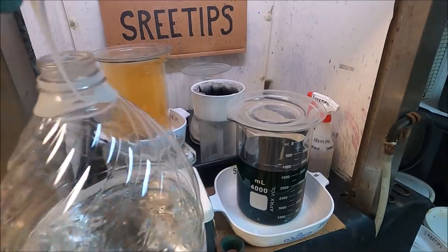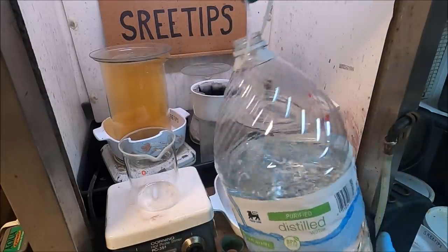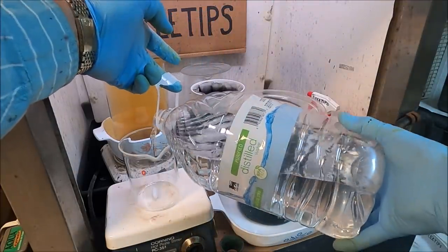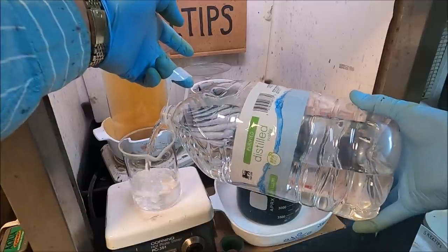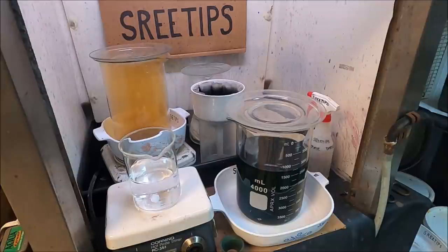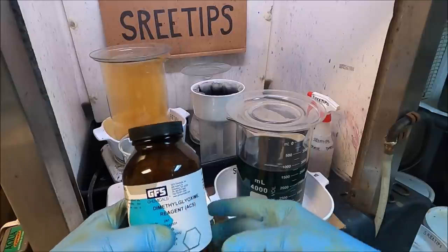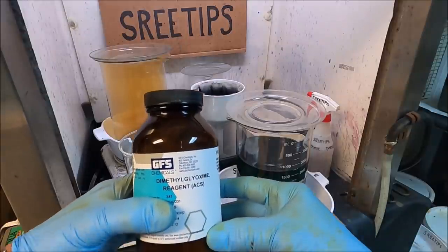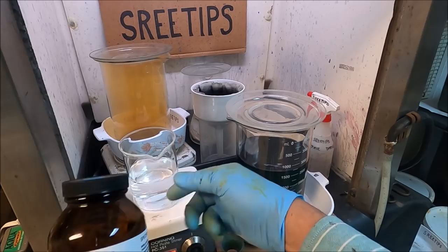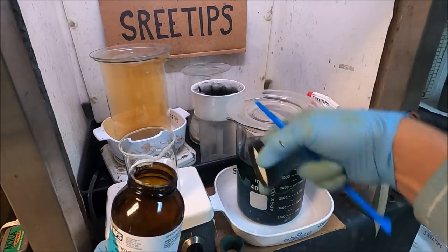Okay, I'm going to add some distilled water to this 600 milliliter beaker here. I'm going to add about 300 milliliters to the beaker. I'm going to turn on some stirring now and put some heat to it. Now I'm going to dissolve a little bit of dimethylglyoxime, DMG, in this hot water, and then we'll add it to the solution and precipitate out the palladium.